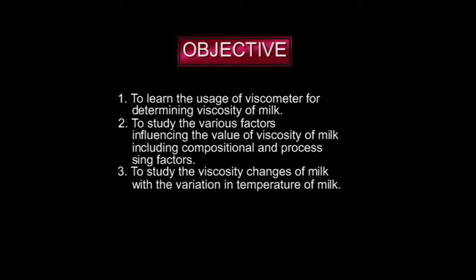Objective: to learn the usage of viscometer for determining viscosity of milk. To study the various factors influencing the value of viscosity of milk, including compositional and processing factors. To study the viscosity changes of milk with the variation in temperature of milk.